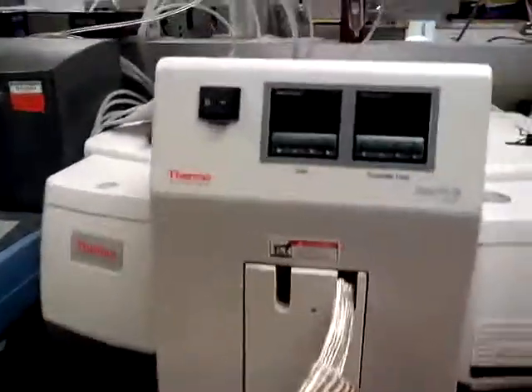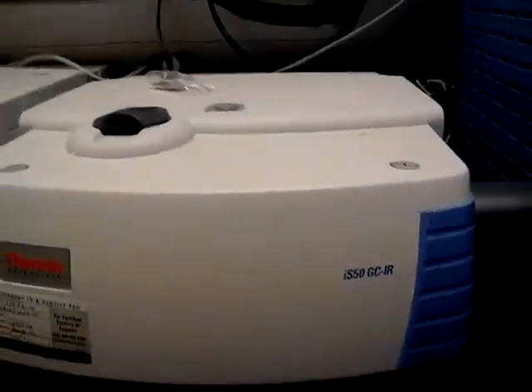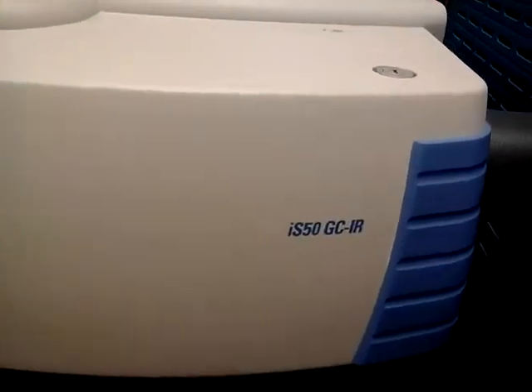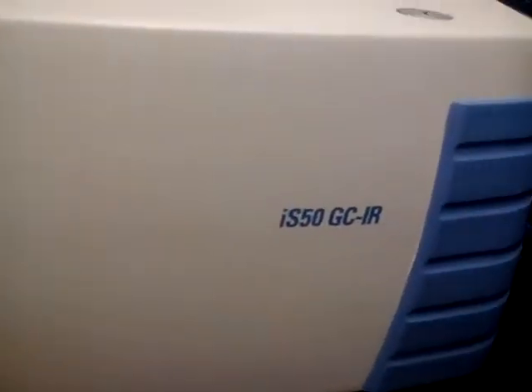But that's not it? No. What? There's still more? Of course. GC, GCIR. Yeah, there we go. Okay, so we can separate and then we can use the IR to analyze functional groups. That's good. Yeah, I like that.